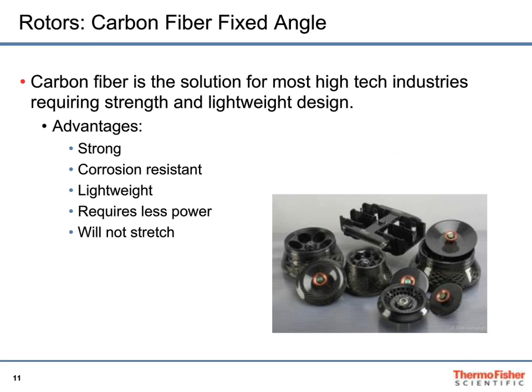Now, one specific thing that's been happening these last 10 or 15 years has been carbon fiber. This has come along into our industry like it has in most other industries, where carbon fiber replaces an engineered metal. Maybe it's aviation, cars. The big one I hear all the time now is bikes, bicycles. But of course, tennis rackets, golf clubs, it keeps going. And one of the key things to understand is that the reason that the carbon fiber comes in and replaces the metal is because of these things you see here.